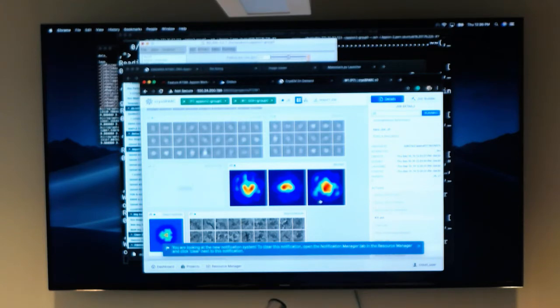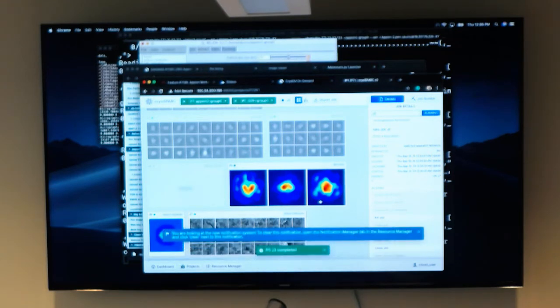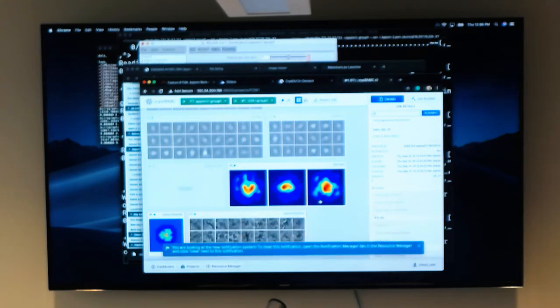Running, so you can queue up jobs before they finish, so they just go on to the next thing. Selecting the 2D class icon, you can do that as well. For example, in that ab initio run, I have 3 classes. I could set up a requirement on each of those classes before it finishes. When ab initio finishes, it'll start 3 independent, or 1, or however many I set for refinement.